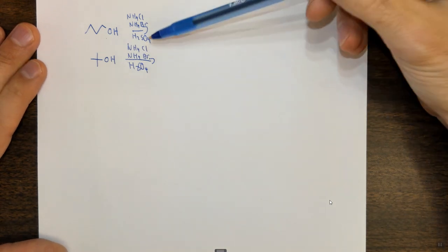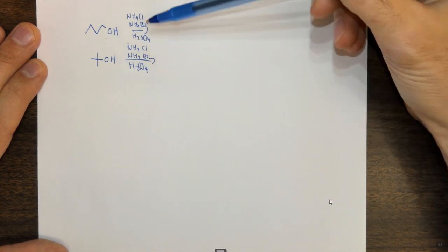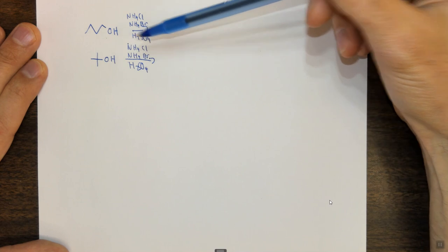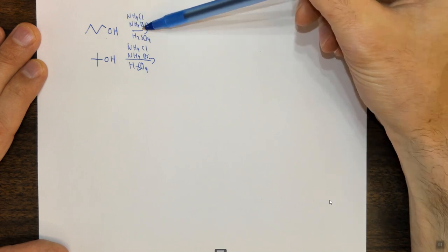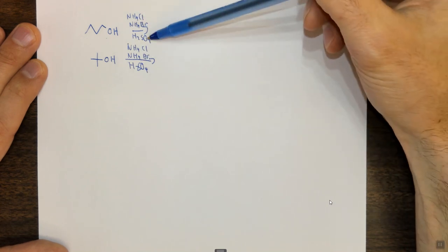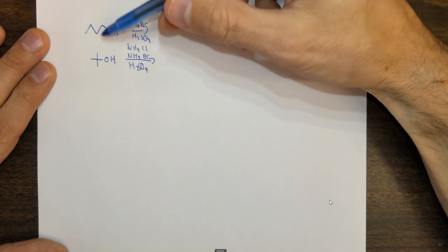Just briefly, what you're going to do is add the concentrated sulfuric acid to ice. This has two effects: it dilutes it and it cools it down. Then the diluted, cold sulfuric acid mixture can be added to these compounds in the hood. If you add straight concentrated sulfuric acid to these compounds outside on the bench, you will not be having a good time, because you will make hydrochloric acid and hydrobromic acid, which are both gases and will go into the gas phase. You breathe in the gas phase, so don't do that. Make sure you add this to ice first, and then in the hood, add them together. Now that we've talked about the safety concerns, which are extremely important, which is why I'm going to mention them a couple of times, what we need to do is look at the difference.